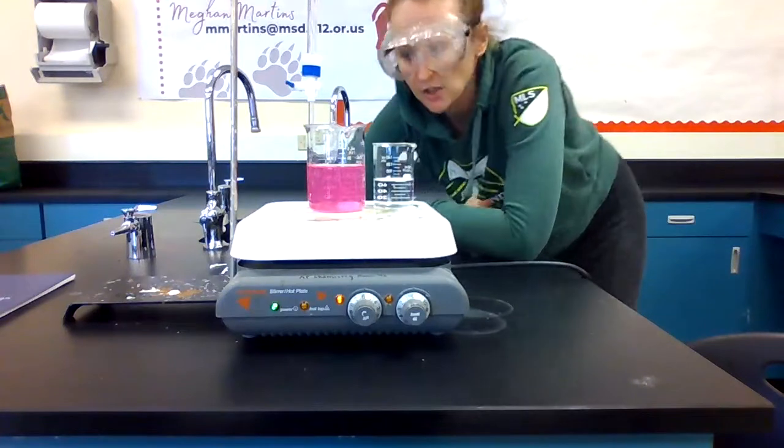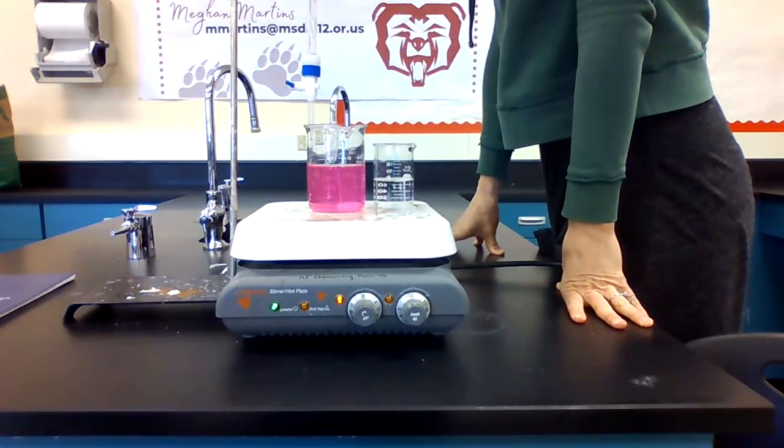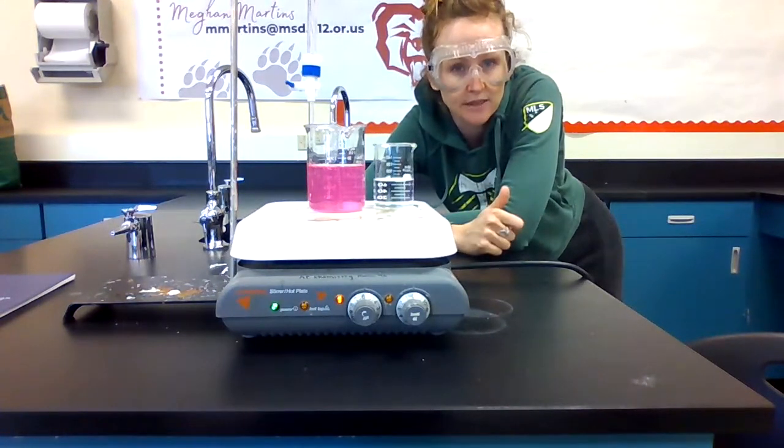And then I started at 0 again, and I added to 4.41. Okay, so I added 4.41. So we would have to add those two in order to get the volume that I added. Okay, so like I said, burettes are a little tricky to read. It is definitely worth practicing figuring out how much volume you actually added to make sure that you know how to do it correctly.